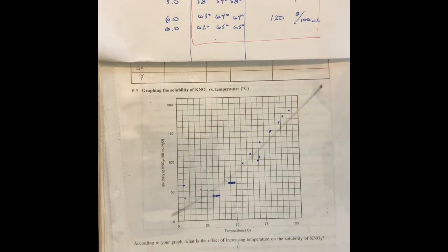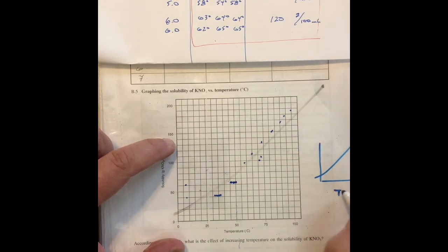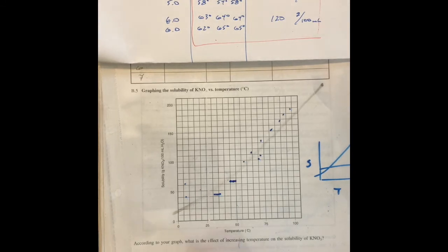This solubility information is shown in the textbook in chapter 9. There's a chart on one side of the page. Maybe I'll go look it up later. In any case, if you just look up solubility, you can see what it should look like for a whole bunch of different salts. Some salts are very temperature dependent. Potassium nitrate is; it goes up rapidly as we look at the temp and the solubility. And other ones are much flatter. Sodium chloride, for example, has a relatively minor temperature dependence on its solubility. All right, so describe what you see down here.